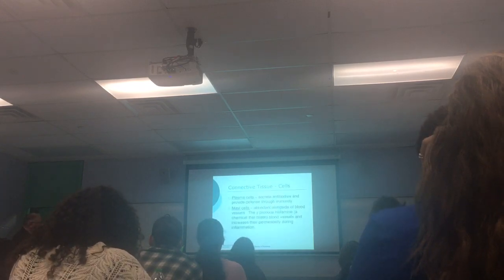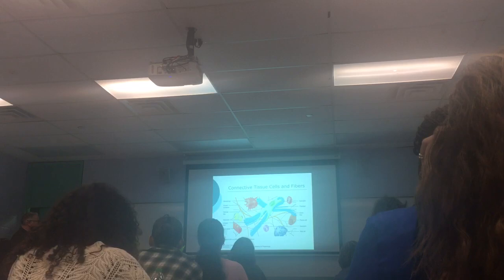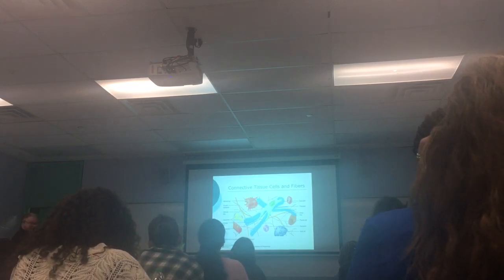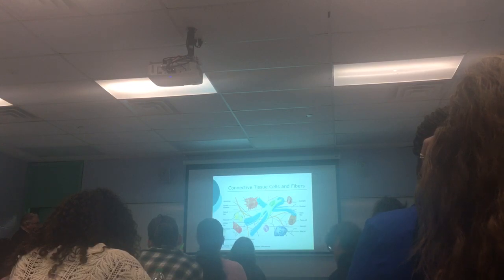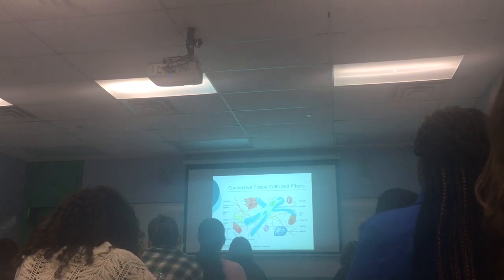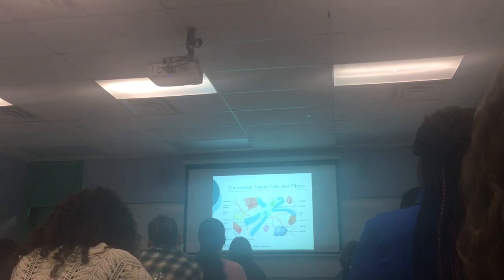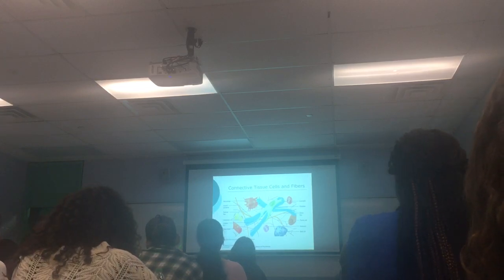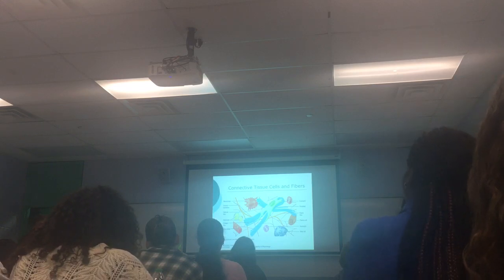All of this beige material here, think of that as the cement, that's the ground substance. All these lines and fibers, these are the fibers. The thick ones are collagen fibers, the slightly thinner ones are elastic fibers, and the little skinny ones are reticular fibers.